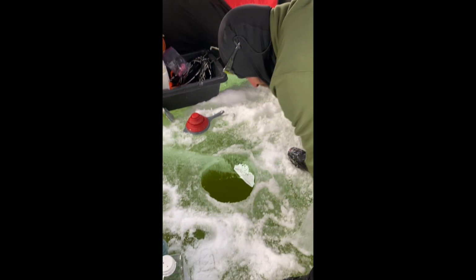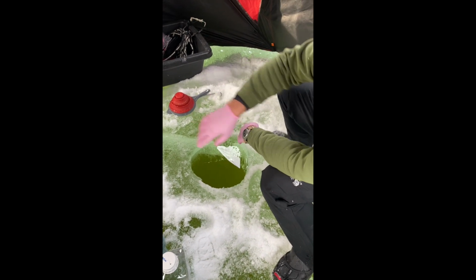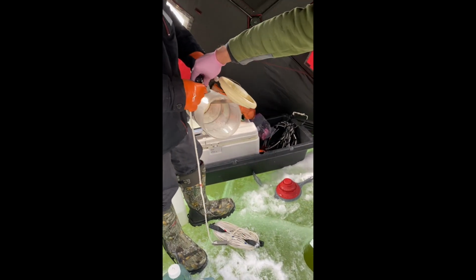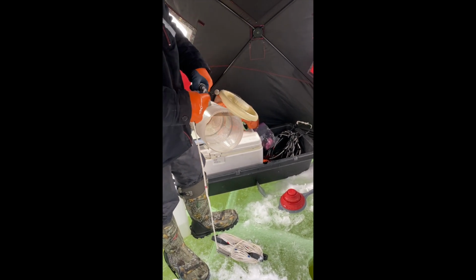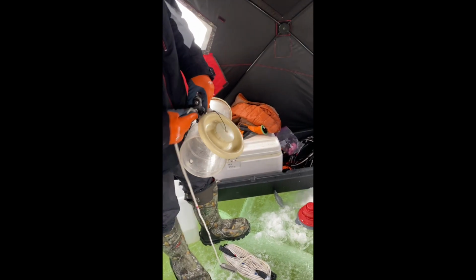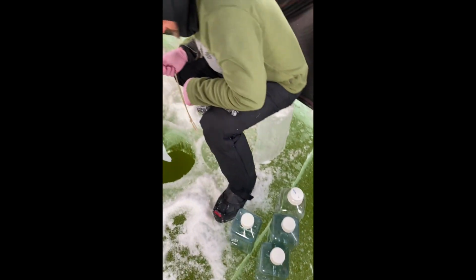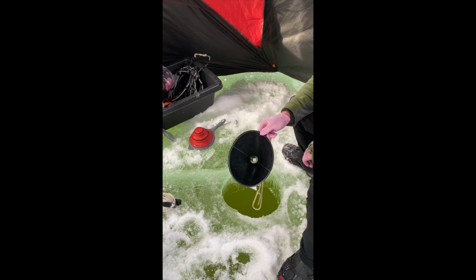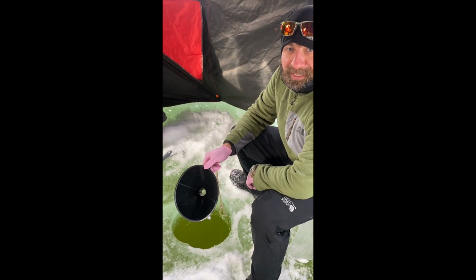So we're going to get our sub-ice measurement. Where's our top? You can see that things are sort of frozen. Again, for that reason, we also usually try to keep our Van Dorn and zooplankton nets in our warm cooler with a bottle of warm water. We have a heater, so we can also put it in front of the heater to carefully thaw it if it's really frozen. We'll be back once we sort these technical difficulties out.